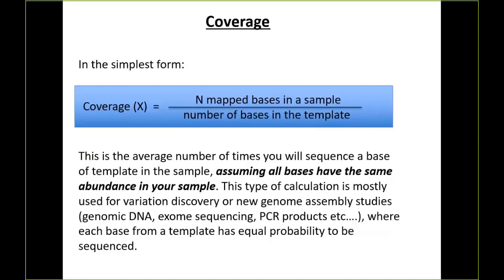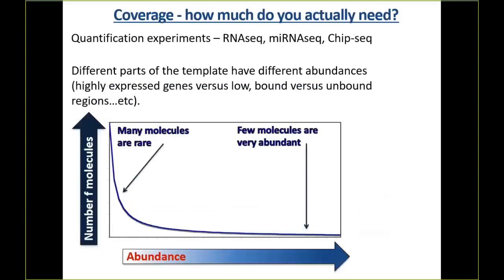So for bisulfite sequencing, it becomes a big deal also. And for bisulfite sequencing, you typically want a lot of coverage. If you only read things on average 5 times for bisulfite sequencing, you start having to combine regions, and it gets a little bit messier. For whole genome bisulfite sequencing, it gets messy because you have a whole genome to worry about. All right, so for coverage, how much do you actually, oh, yes?